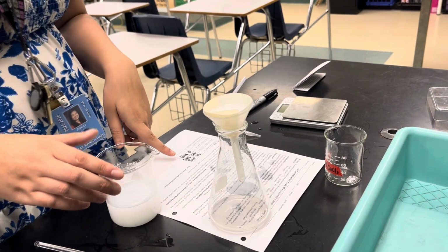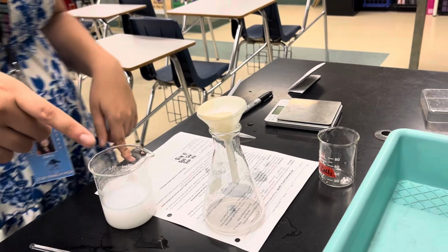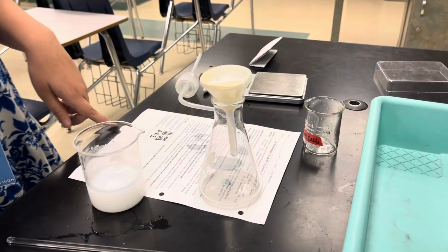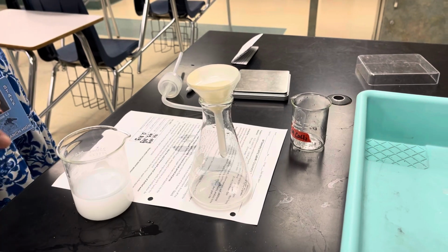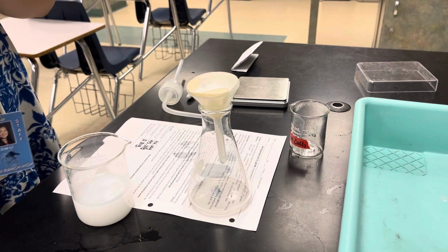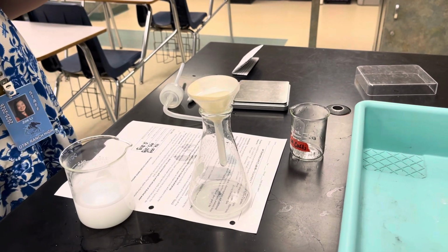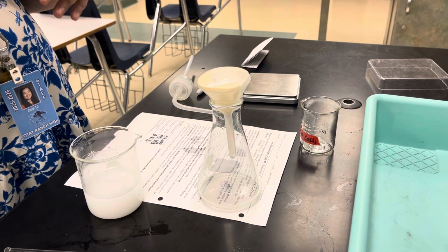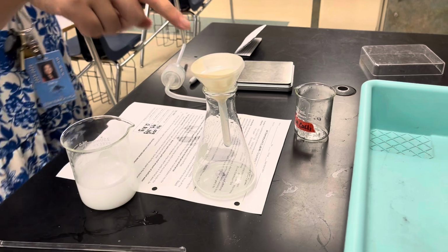So what we need to do is dry it. We need to dry it for a very long time so that we can make sure that there's absolutely no more water left. So we're gonna put it in the back in a drying machine that's gonna heat it up over the weekend, and we're going to be able to dry it and then get the final mass of just the chalk that is left in here.